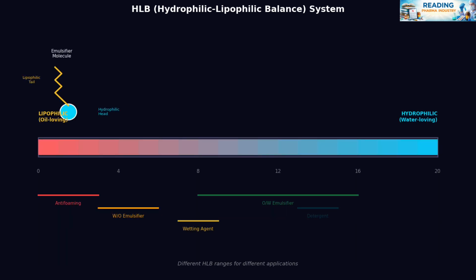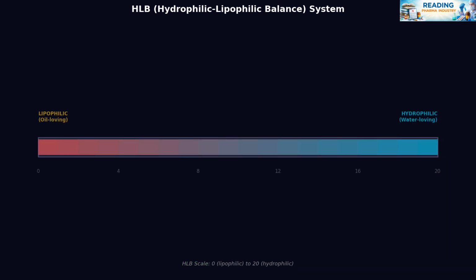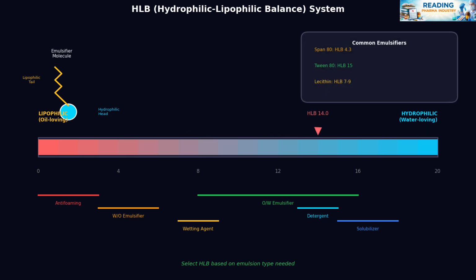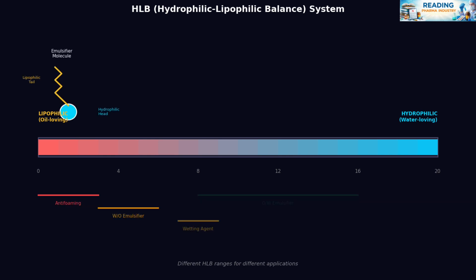If you look here on the top left, this is how the surface active agent or surfactant molecule is represented. So here you have a carbon chain, which is indicated by the yellow branch, and at the end you get the hydrophilic part. And that is basically the blue circle, the part which likes to be associated with water.